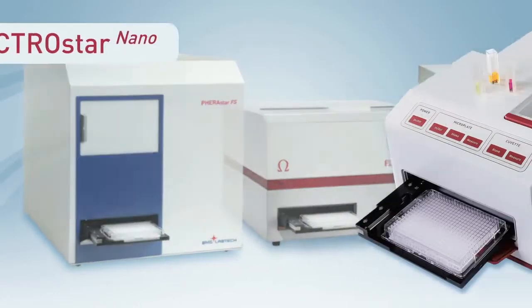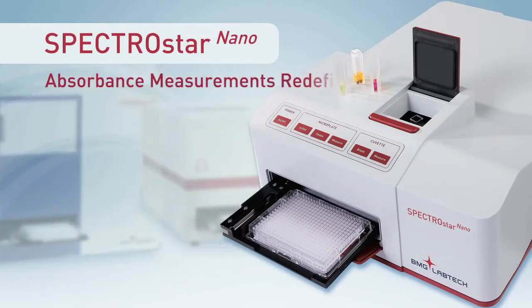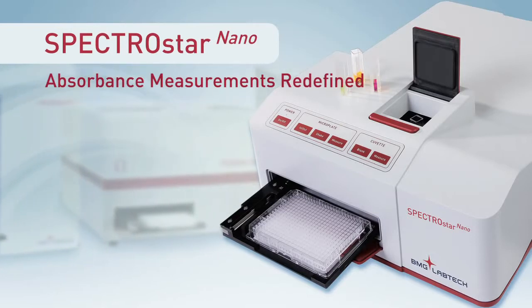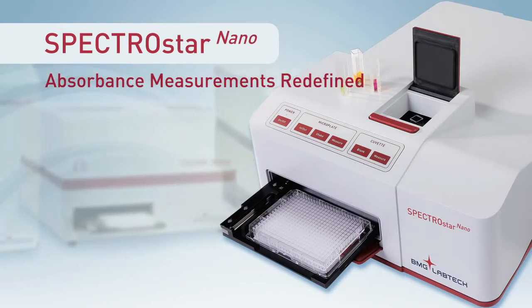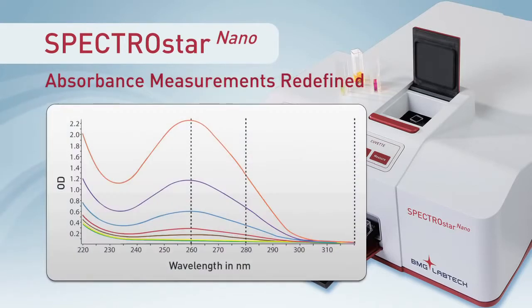BMG LabTech is proud to introduce the SpectroStar Nano, an absorbance spectrometer that allows you to easily and instantly capture a full absorbance spectrum for low-volume samples, microplates, and cuvettes. The SpectroStar Nano is a revolution in absorbance measurement.